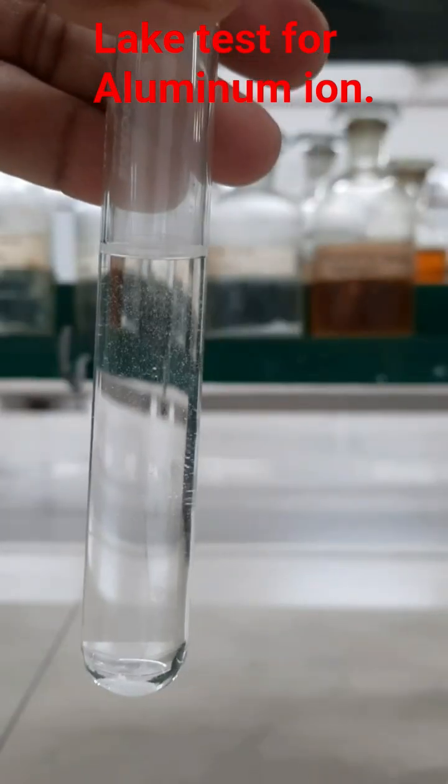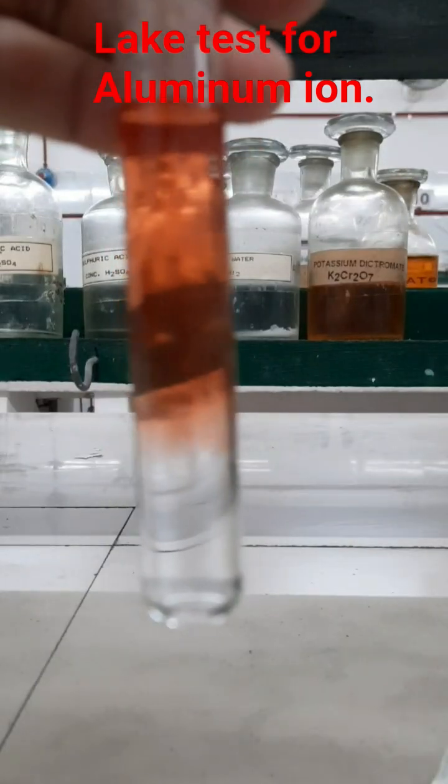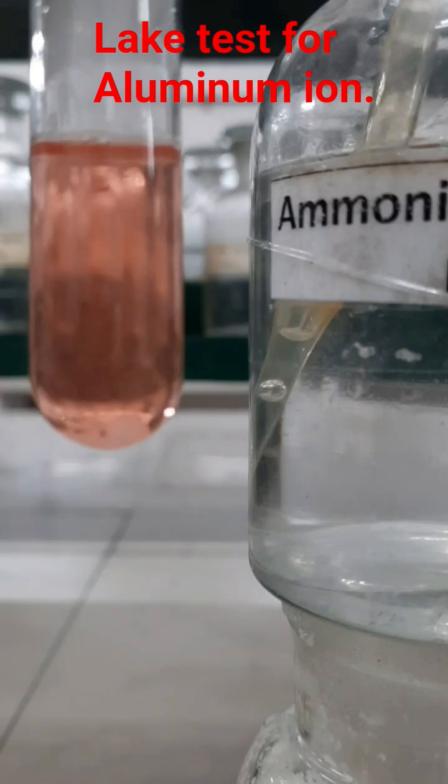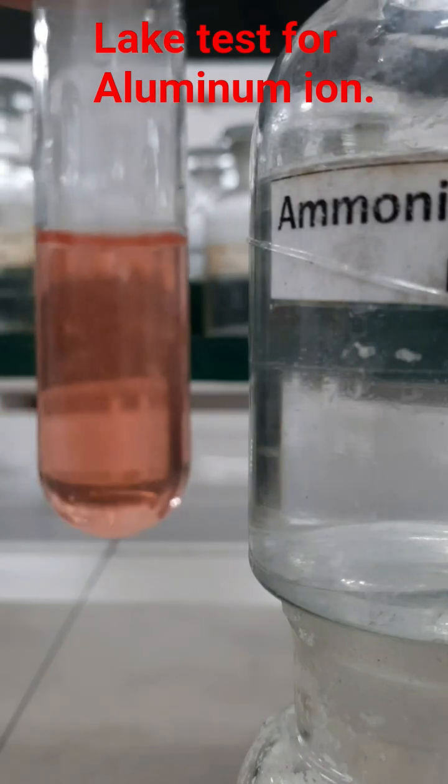Here is the blue litmus solution. I am adding a few drops of blue litmus solution into it and the color of the dye turns red. Now take a small amount of this mixture and then add ammonium hydroxide solution into it.